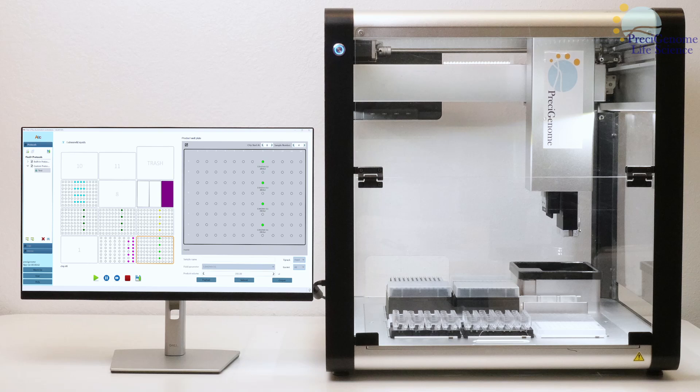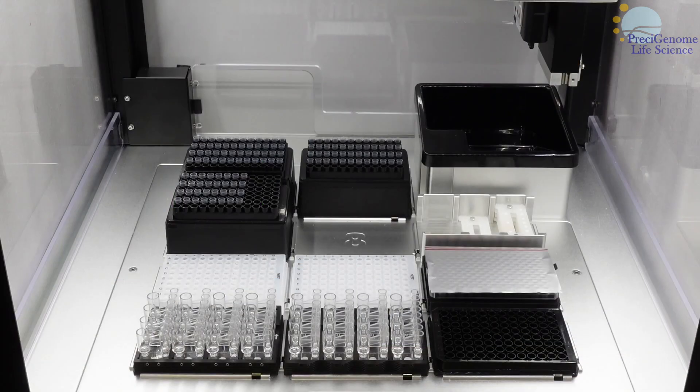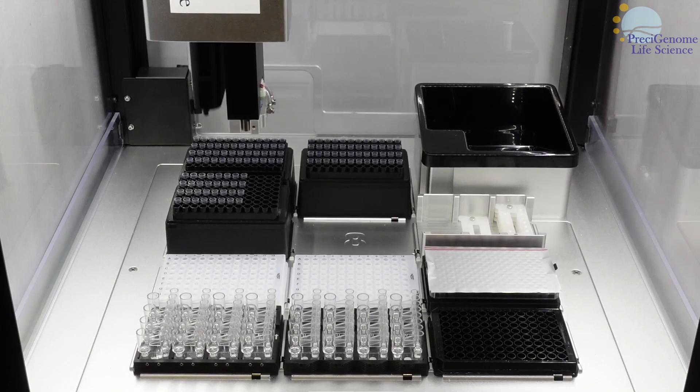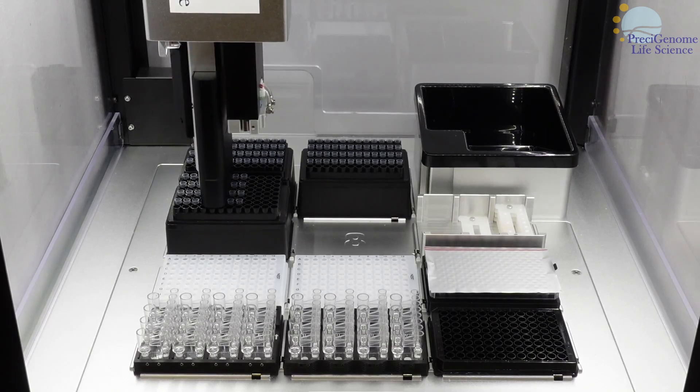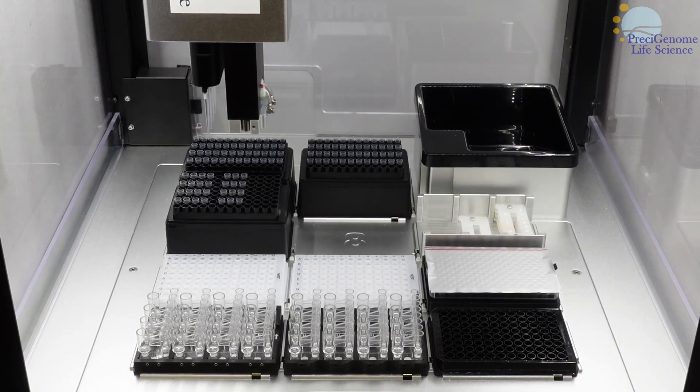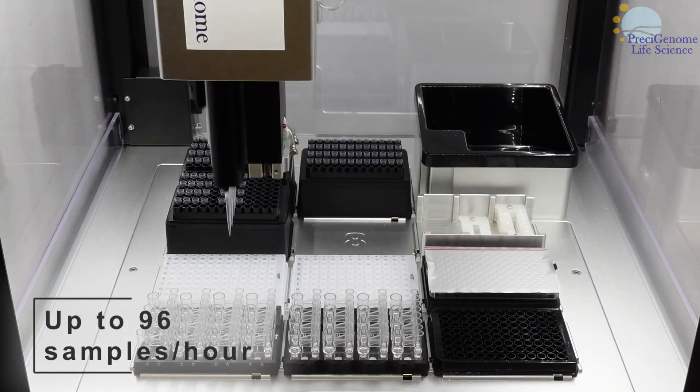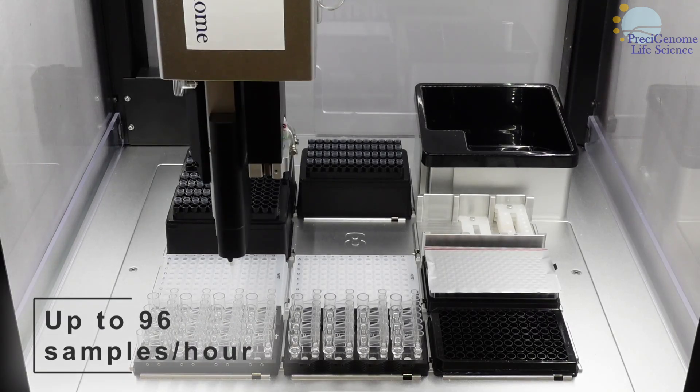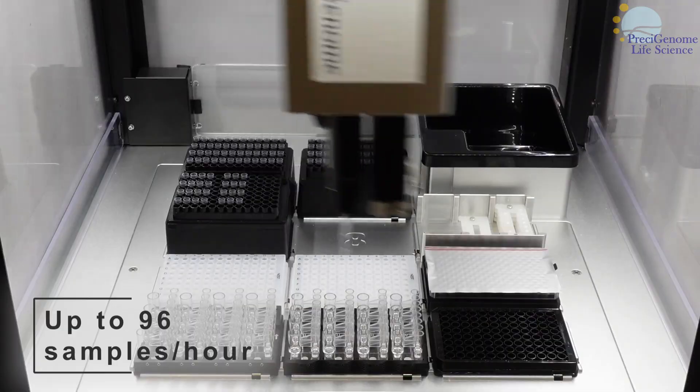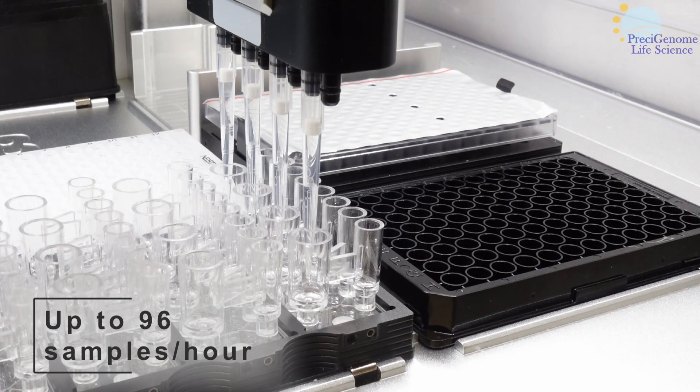In this video, we will go over the nanogenerator FlexS Plus. Used for high-throughput screening of LNPs, it is a convenient automated solution which can process up to 96 samples per hour.